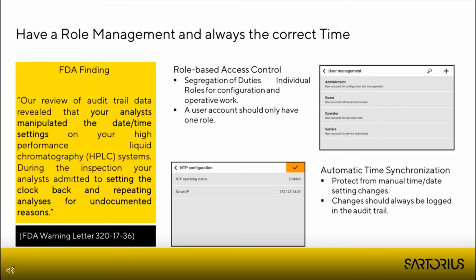So in this warning letter, for example, the analyst has the possibility to change the system date and time and use this for setting the clock back to repeat some analysis. And to prevent these kinds of issues, you should make sure that each user account has only the rights that are needed for the work.